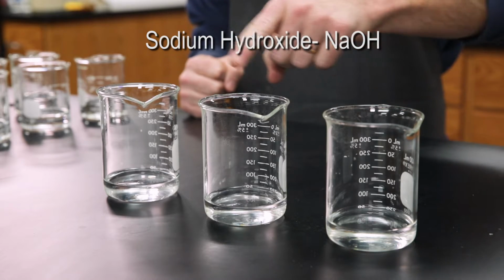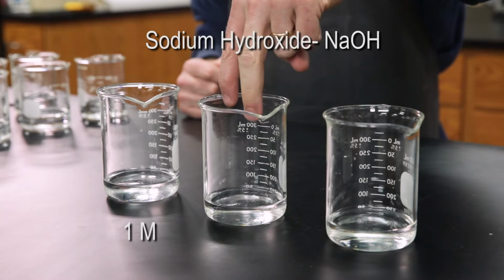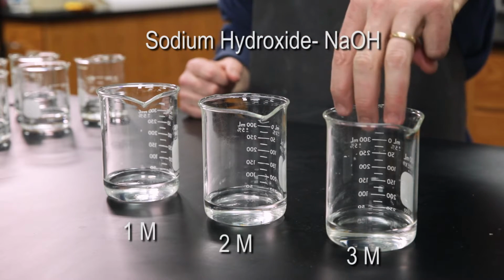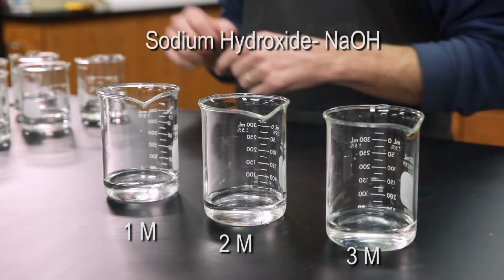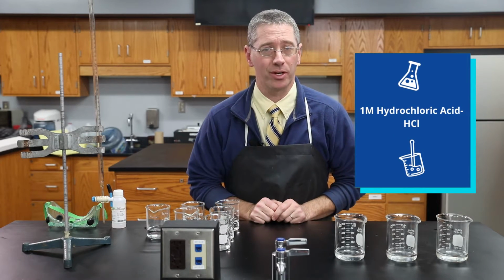In these three beakers, I have base. This one is 1 molarity sodium hydroxide, this one is 2 molarity sodium hydroxide, and this one is 3 molarity. So 1, 2, 3 molarity. In these beakers, I have all the same. They're 1 molarity hydrochloric acid.